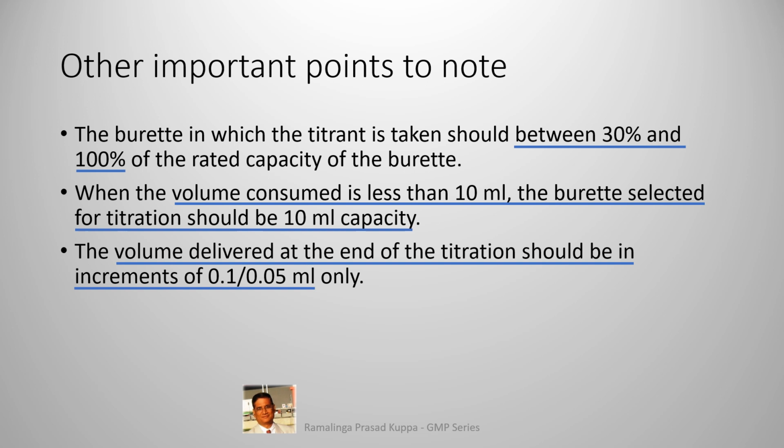This is another important point to note. It is always recommended that near the endpoint, the volume added should be in least count volume. It is mostly 0.1 ml for 50 ml burette and 0.05 ml for 10 ml burette.